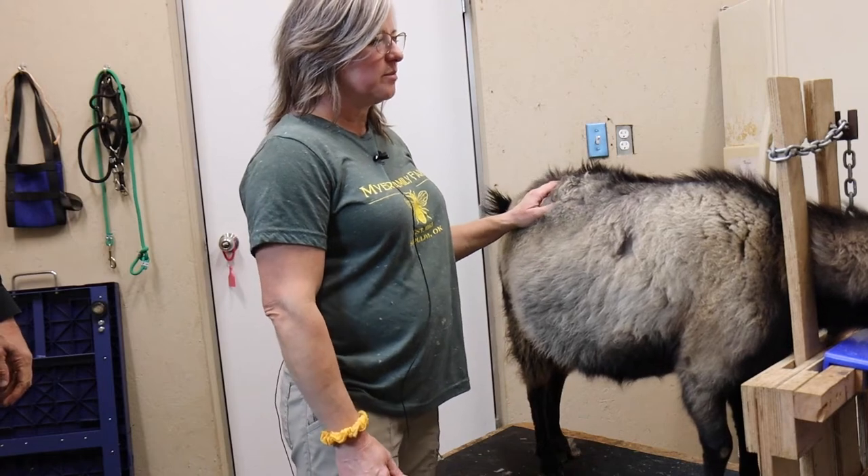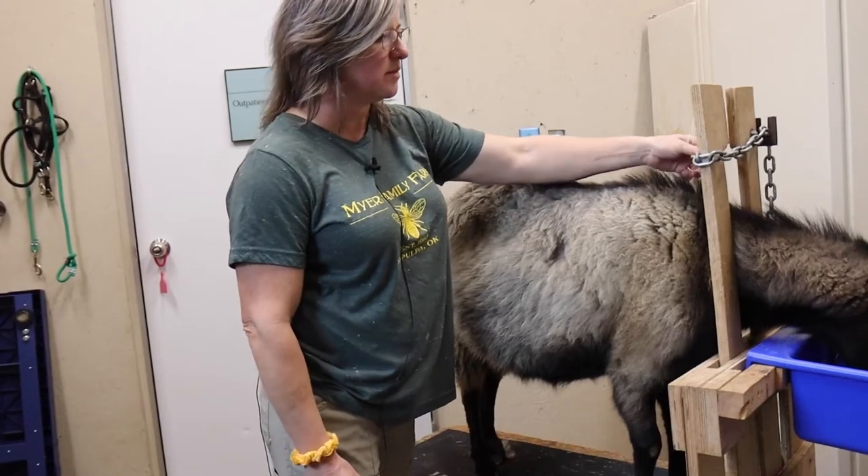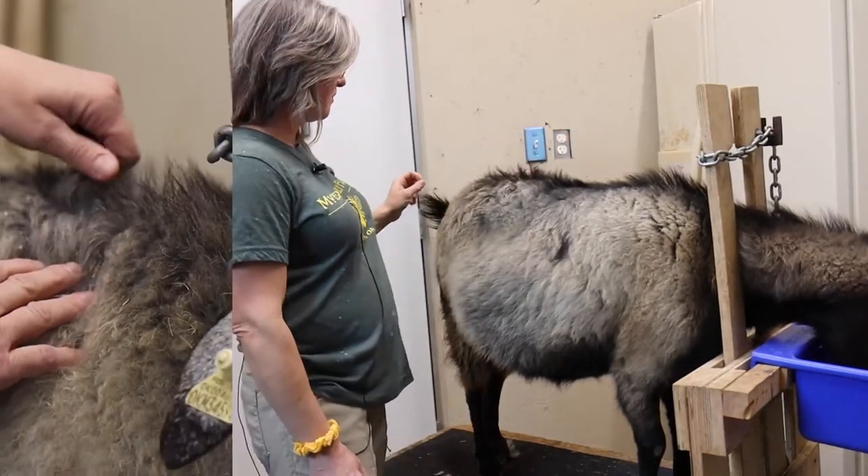To collect our DNA sample, we need to pluck guard hair from the goat. The easiest place to do this is somewhere on the ridge line where the guard hair is standing up, or the tail.